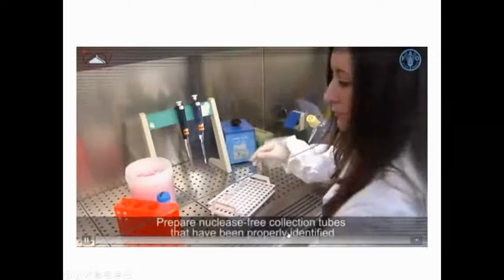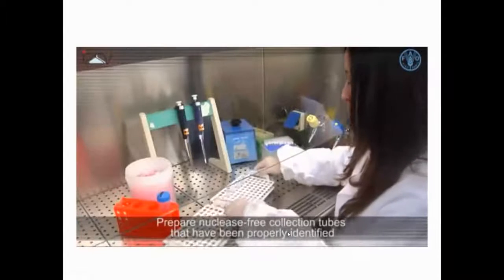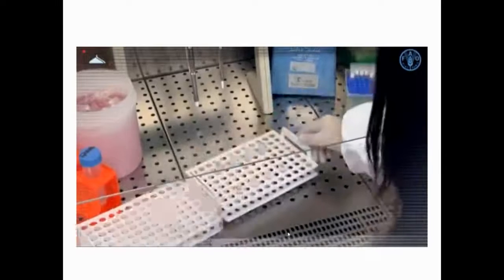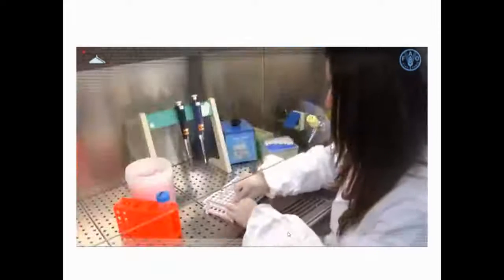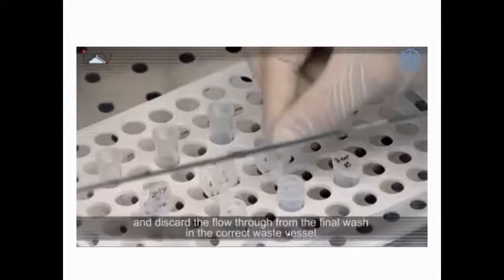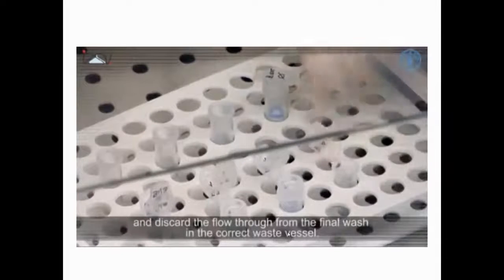Prepare nuclease-free collection tubes that have been properly identified in order to collect the RNA eluate and to store it. Place each column into the nuclease-free collection tube and discard the flow-through from the final wash into the correct waste vessel.